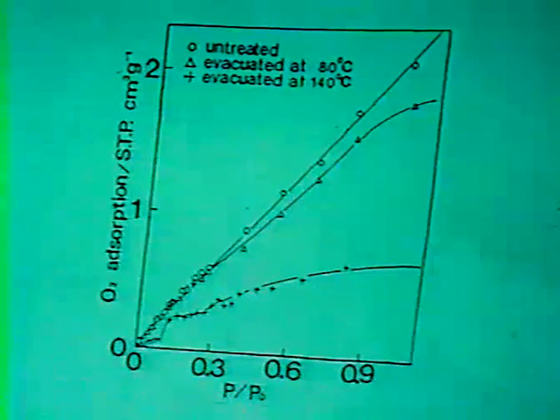This shows the sepiolite containing zeolitic water, and this shows sepiolite tetrahydrate. Its tunnels become empty when the zeolitic water is evacuated. A stepwise change was observed in this curve.